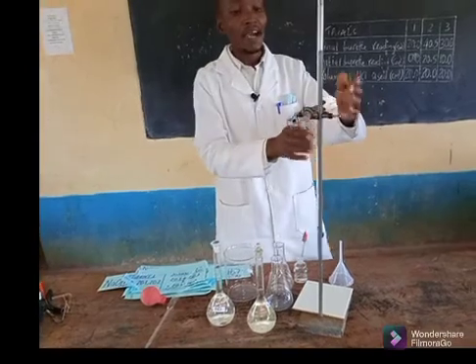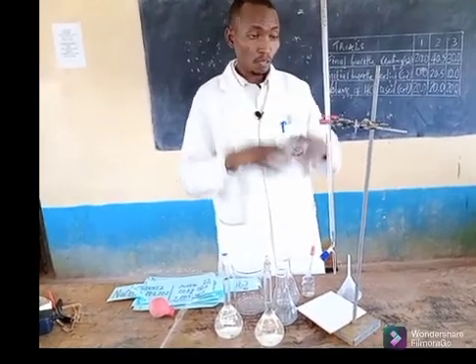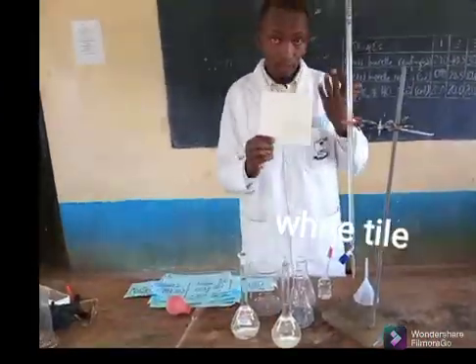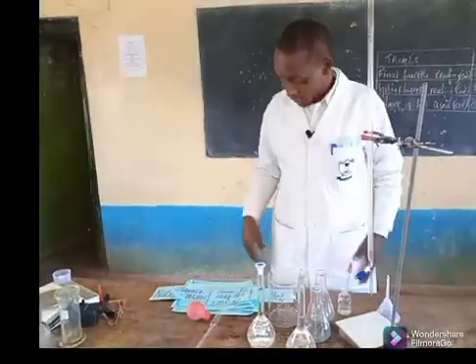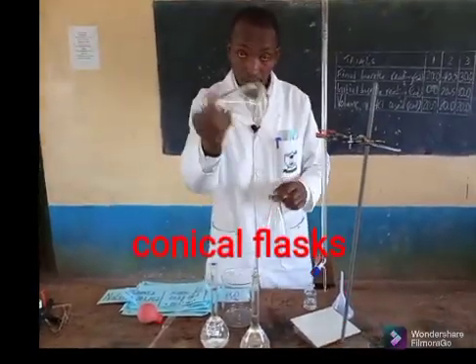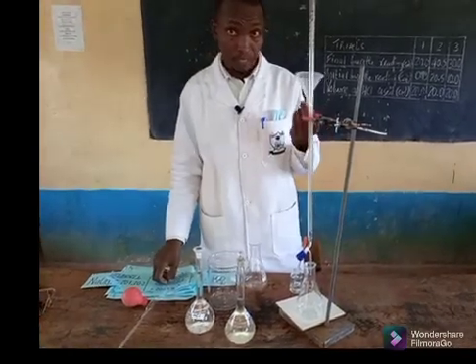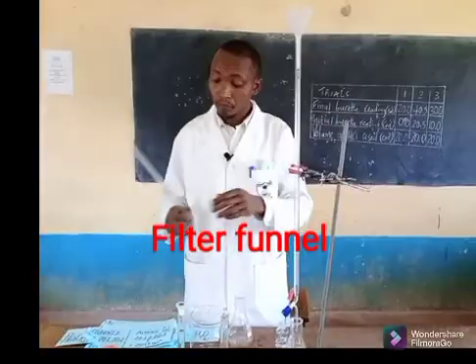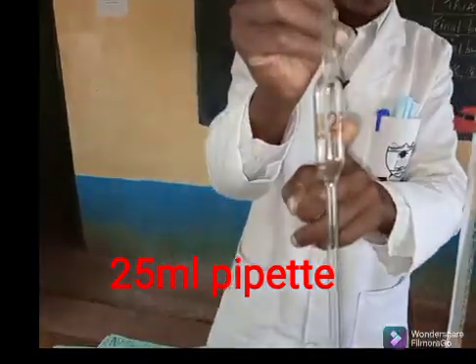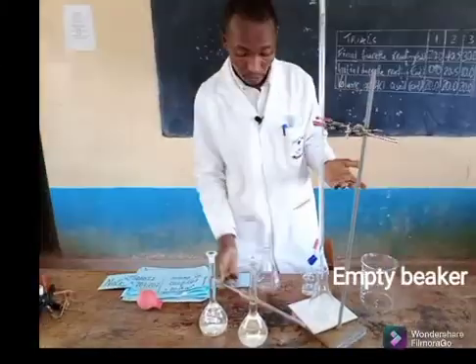The apparatus I need: I have a burette mounted onto a stand. Ensure all the time the readings are facing you, and anytime you are putting the solution the level should be at your eye level. We have a white tile — it will help me contrast the colour. We have phenolphthalein; this will be my indicator. I have a conical flask — the best apparatus for titration. I will use a filter funnel if needed. Then I will use a 25 mL pipette. Always bear in mind the capacity of the pipette. An empty beaker will help me discard any solution I don't need.